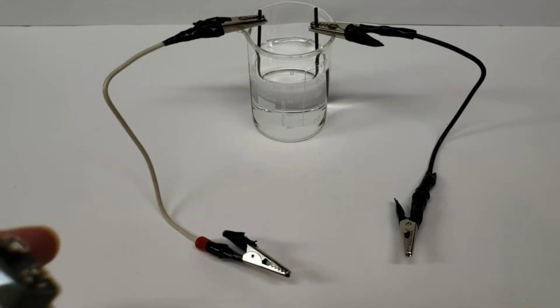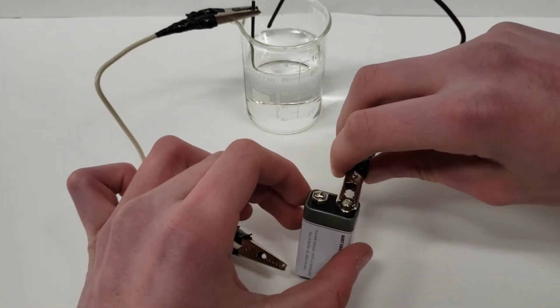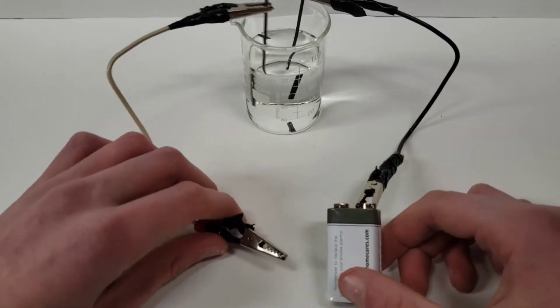And then repeat the exact same thing for the other electrode and the other wire. So now that both wires are in the water, it's time to hook up the battery. For the 9 volt battery, it's pretty simple, you just hook one wire to the positive end and one wire to the negative end.